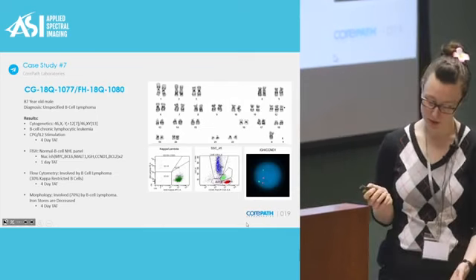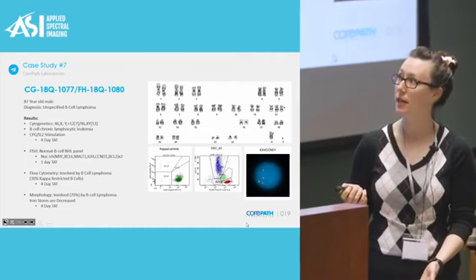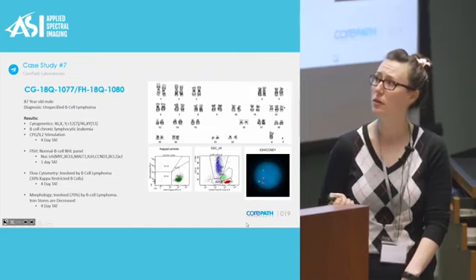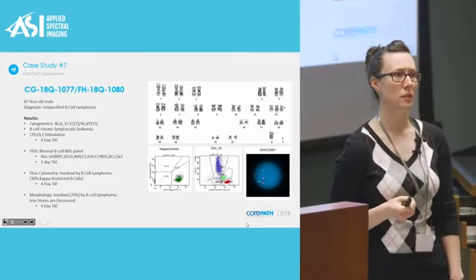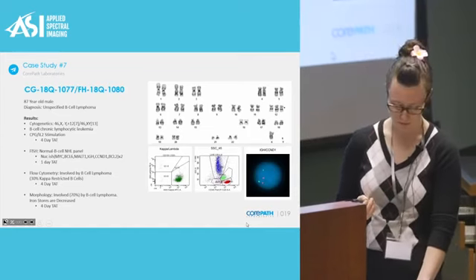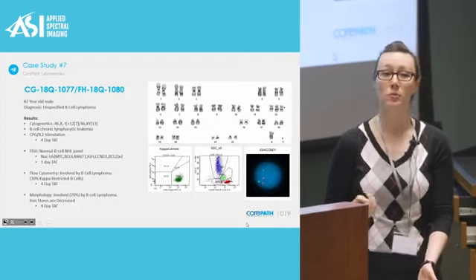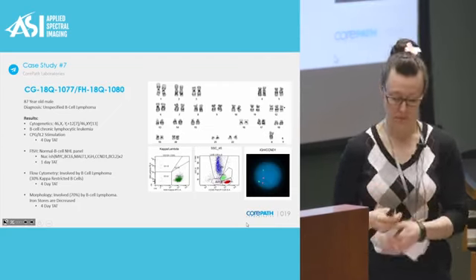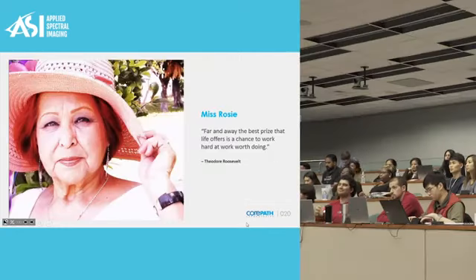The CpG-IL2 stimulation was able to provide further and finer detail into the diagnosis of this patient. The trisomy 12 is very important for a lymphoma case, providing more information for the clinician and for diagnostic purposes. So because of this stimulation, we were able to detect something that otherwise would not have been detected, providing further clarity. So to wrap things up, I wanted to touch base on why we do what we do.